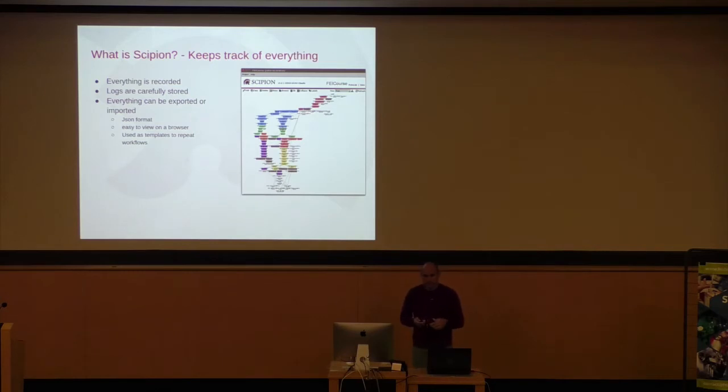As I said before, it keeps track of everything. This is a workflow that we use for training. And you can see at the very top, you have the import where you register your data, your movies, your micrograph, whatever you want to start with.